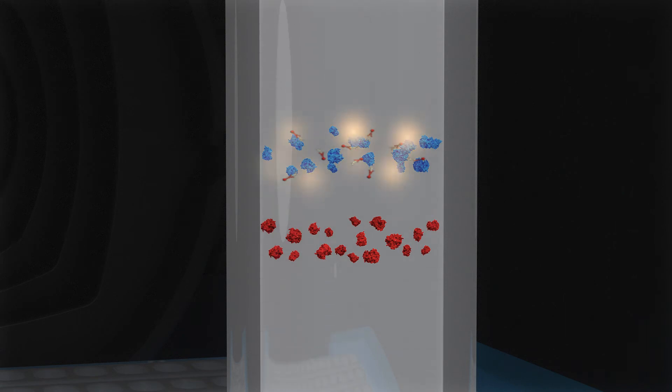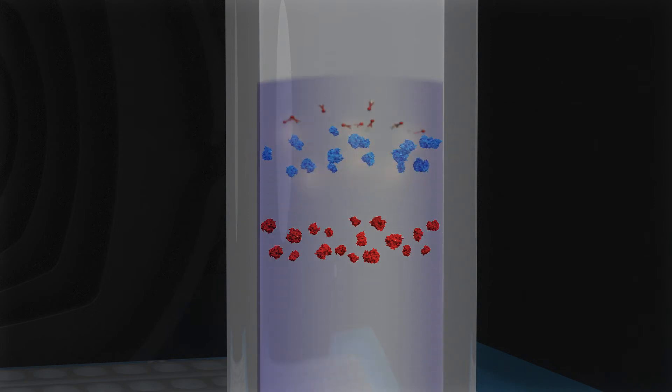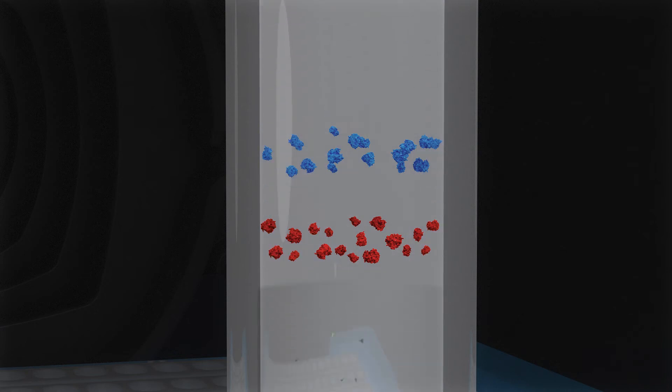The chemiluminescent reaction is recorded by a CCD camera in a series of images over time. With RePlex, Abby will then remove all antibodies from the first immunoprobe with a proprietary reagent.